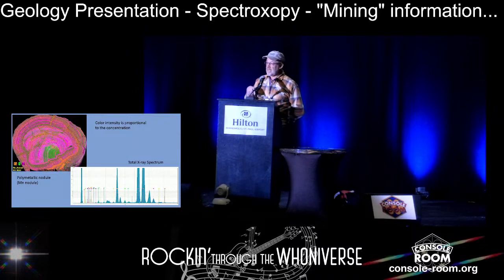What we're seeing is what we call an energy dispersive X-ray spectrum. The X-ray detector in there detects all of these at any one time. That's a sum spectrum, X-ray data from across the whole of that sample. We can actually select little portions of that, which is quite useful as well.